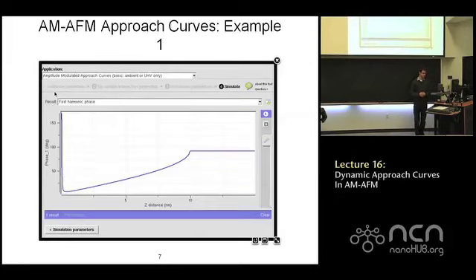The second result I'll discuss here is the phase lag of the oscillation. Here we approach, again, at its initial value of about 90 degrees. And then, because of the detuning from the interaction, it starts to shift. Okay?